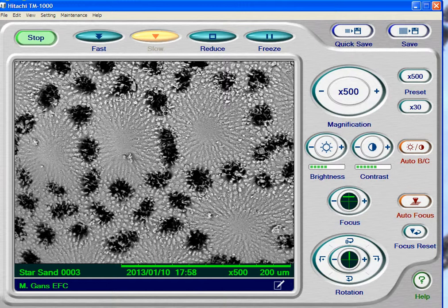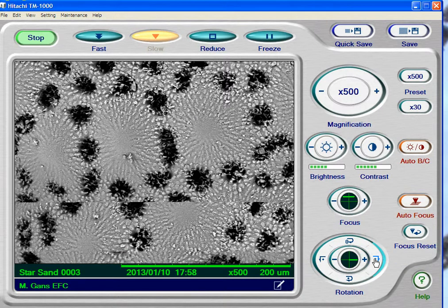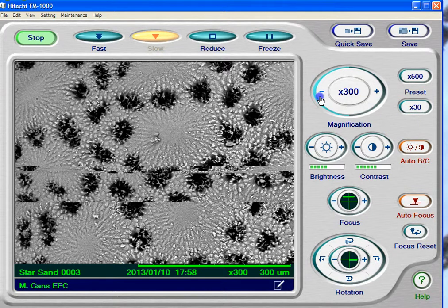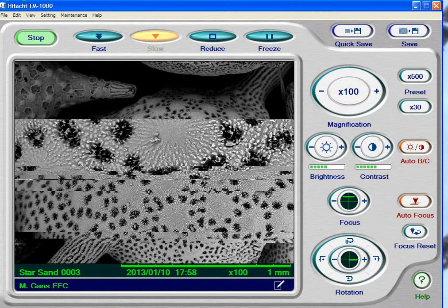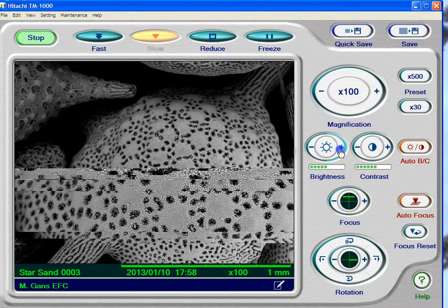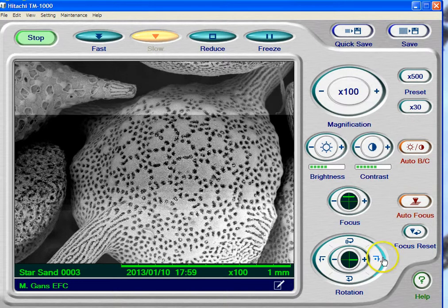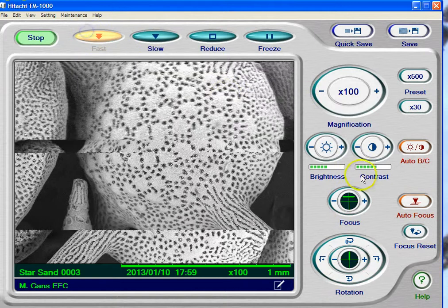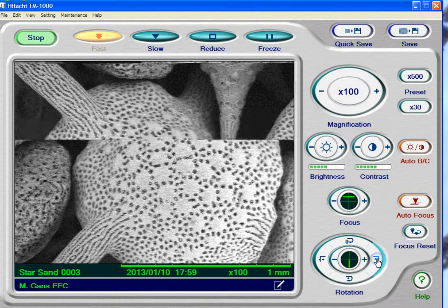Let me show you one more thing that's kind of cool. Let's say you don't like the orientation of this picture. Down here, you can click and turn it by 90 degrees — we're just changing the path of the electrons. I'm going to zoom out to 100X so you can see what's going on. If the composition isn't quite right, I'm going to run the brightness up a little bit. Then to turn the picture, I just click here and it turns the picture by 90 degrees. I can continue to turn it, just rotating it.